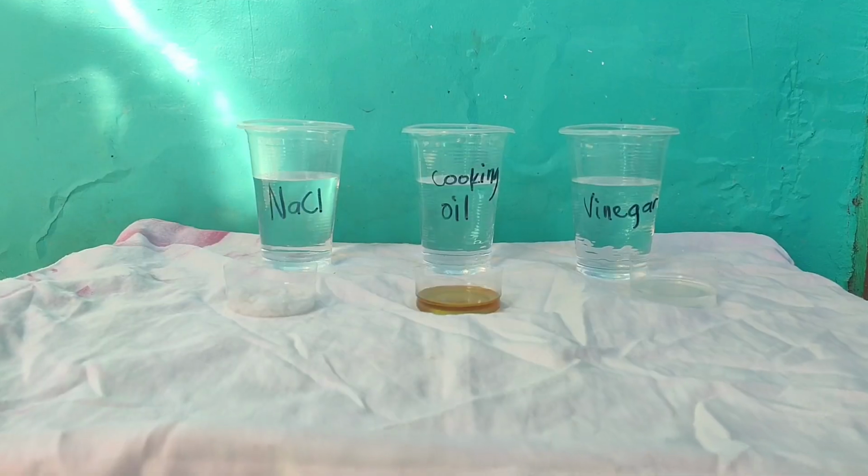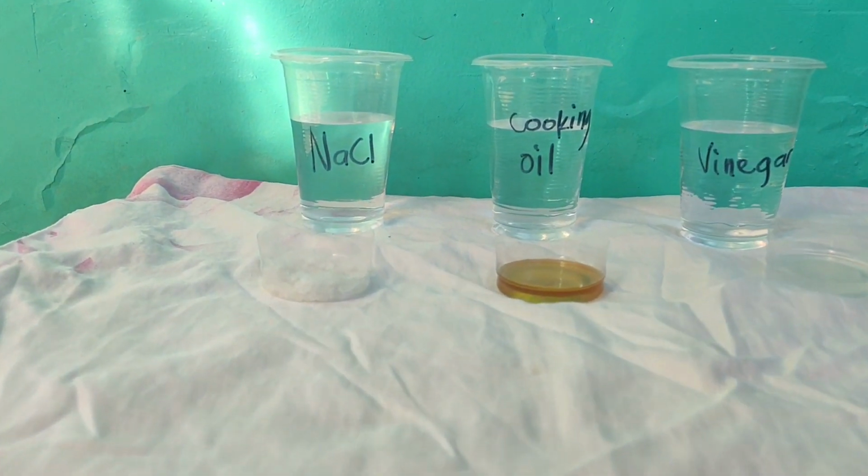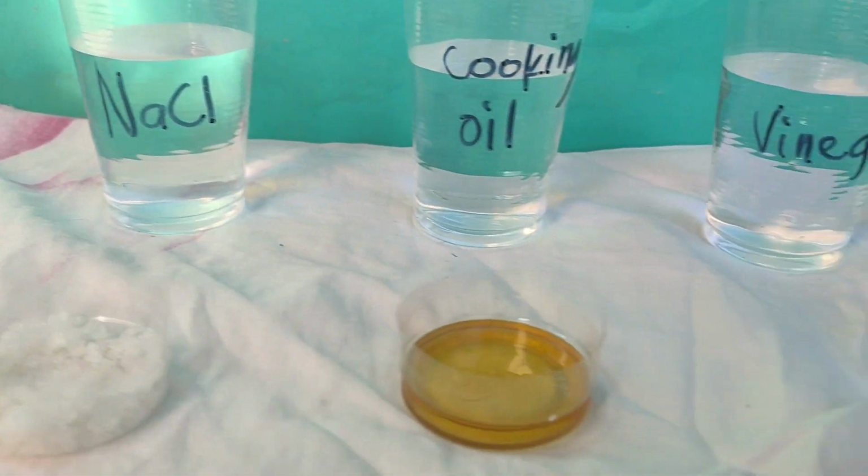So I am here to demonstrate the water solubility and the surface tension. The first step is I put labels on my test tubes or disposable cups, and I add water to each test tube.